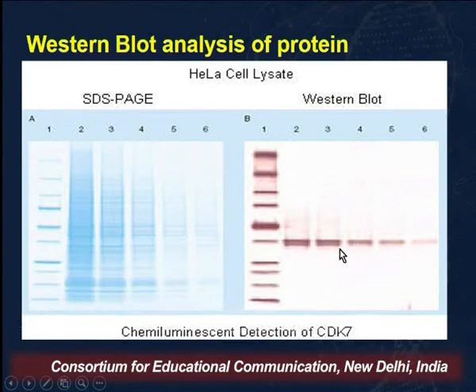So you can compare the different diseases. You can know the size, you can talk about the expression or the production of different proteins, whether it is occurring or not, and of course for the detection, whether it is present or not present. So a typical Western blot occurs just like this, and you can know more about the biomolecule, which is the proteins that are present or not present.